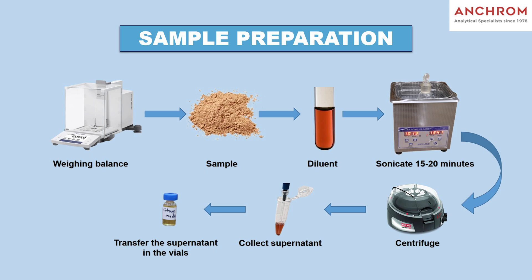Now, we will begin with the sample preparation for our samples. The samples are prepared as per USP Chapter 203.